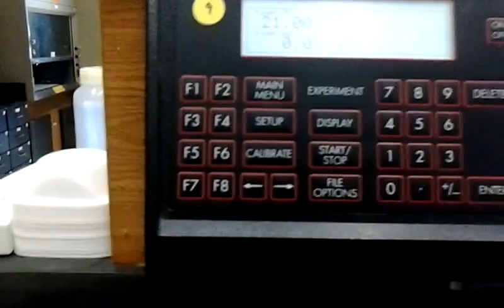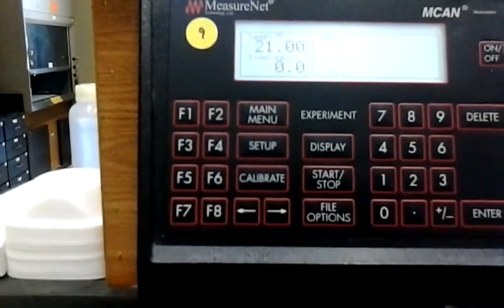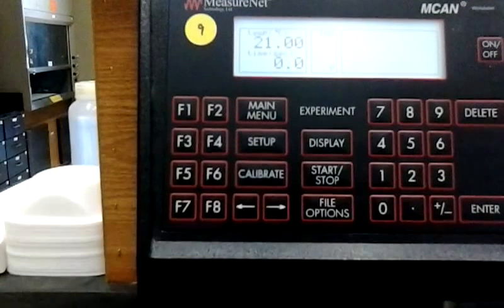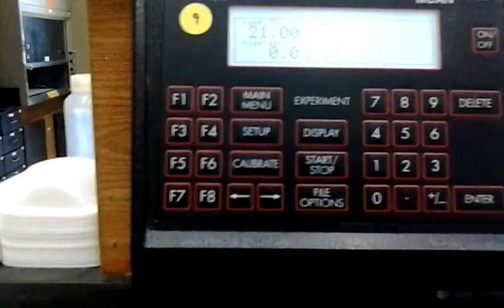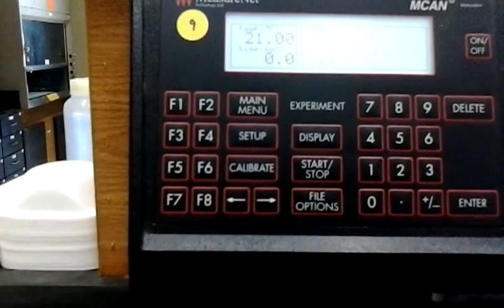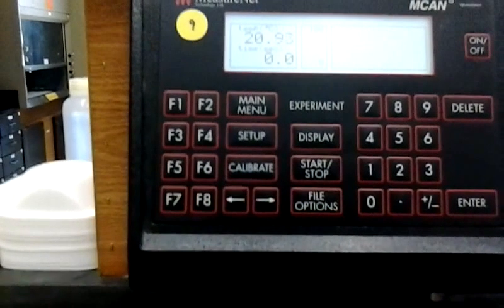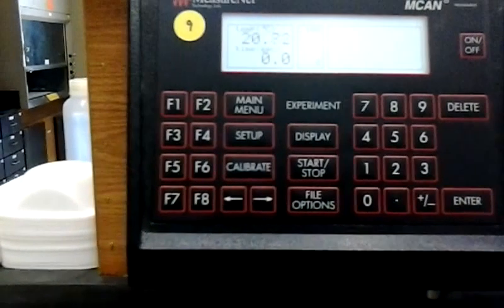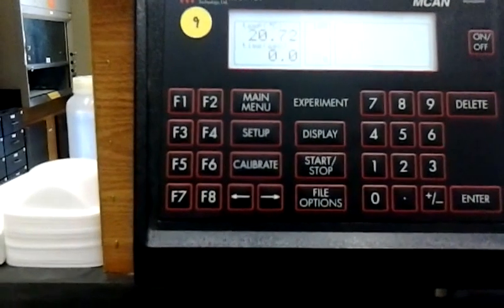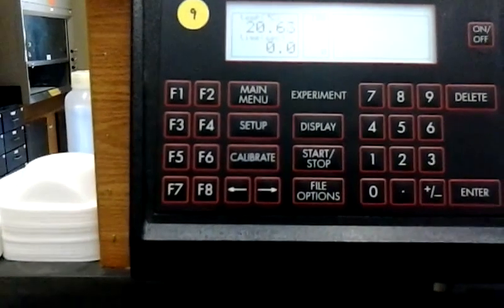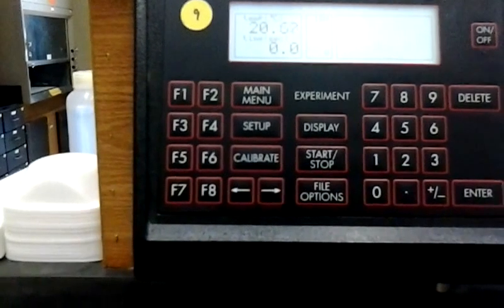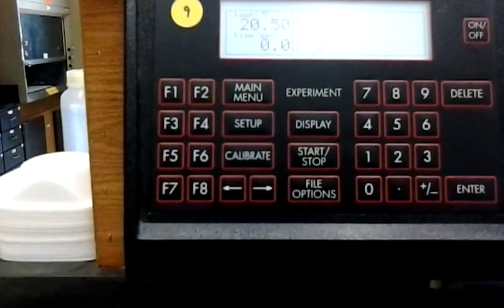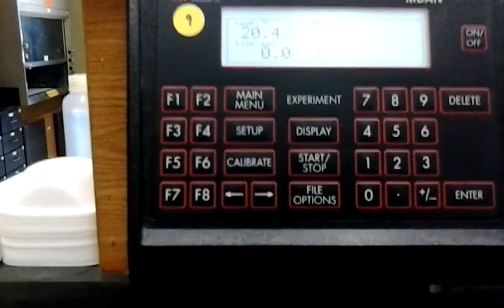So as you see now, the current temperature is 21 degrees Celsius. What you can do is now place your temperature probe into your experiment to record the temperatures for the experiment that you're conducting.